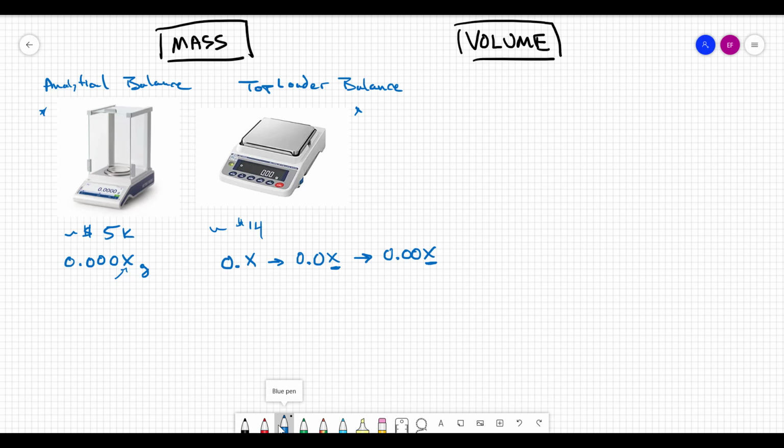So what situations would you need these different balances? Well, this goes back to what you learned in, say, a general chemistry course, which we're going to talk quite a bit about in this course, which is, well, how many digits of significance do you need in the analysis that you subsequently do with that number? In other words, am I measuring a number where it's really important to, say, the 1/10 of a milligram, exactly what mass I'm measuring? An application of this might be medicine, right?